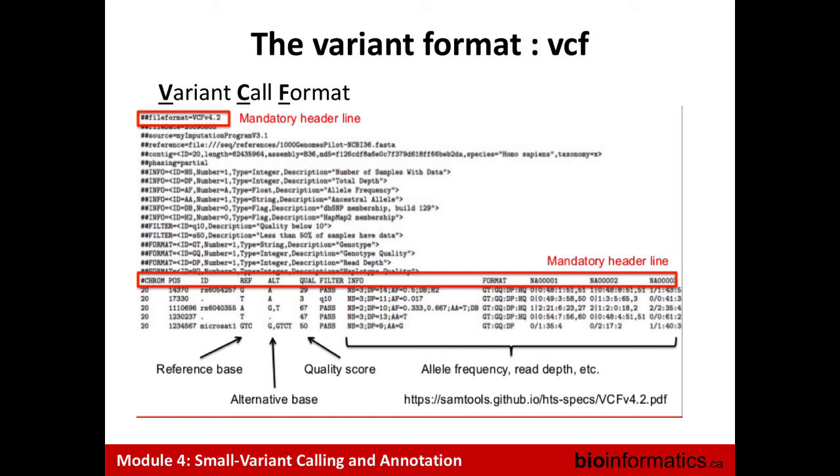Is the fourth one a variant? The fourth one, no, I think it's not a variant. Probably it has been, as I say, a multi-sample approach. They look first in the genomes to find positions where there are possibly variants. So they find this position, maybe some reads in each sample, there were few reads that have been found as possibly a variant, so they include it in the positions they will look for variants, but at the end, when they do the maximum likelihood, they say, oh no, no sample seems to have something, so probably it's not a variant, so that's why it's here.